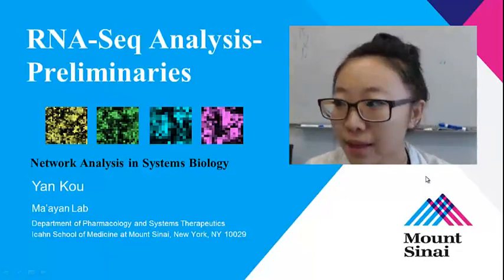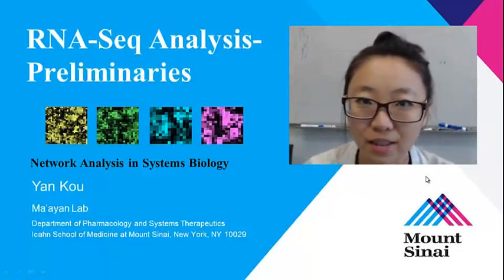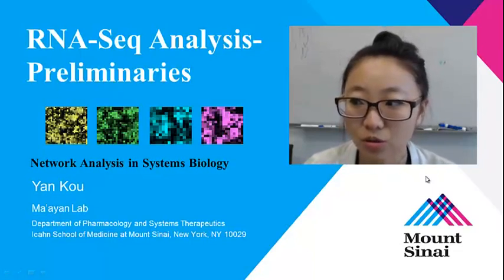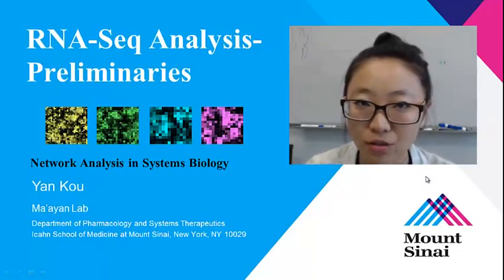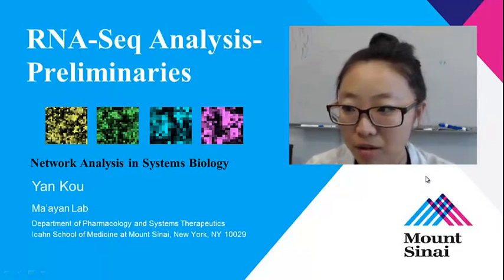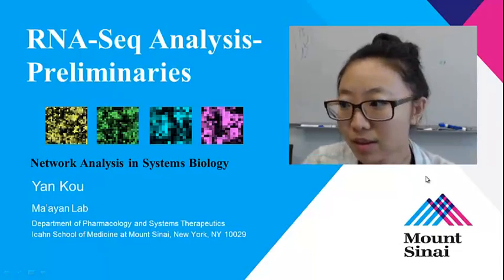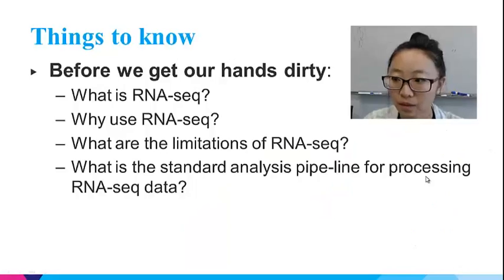In this and the following lectures, I will guide the basic analysis of next-generation sequencing step by step. I will also introduce the basic usage of Linux/Unix commands and software R, as many bioinformatics tools are built with these open-source platforms. Let's first start with the RNA seq analysis.